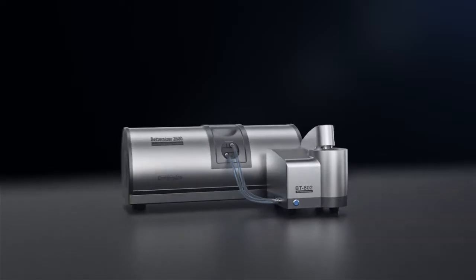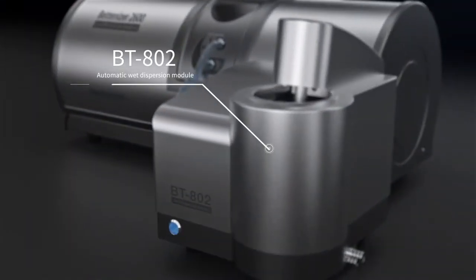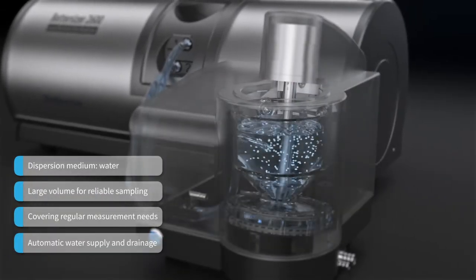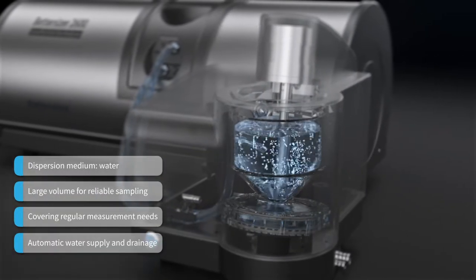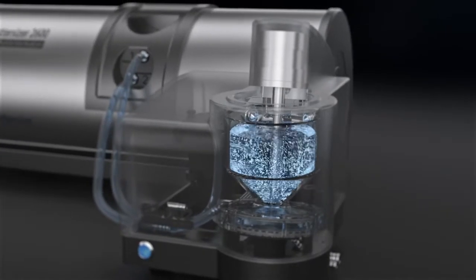Matching up with the BT-802 automatic wet dispersion module, the BetterSizer 2600 can efficiently measure the size distribution of particles dispersed in aqueous mediums. Adjustable stirring speed and built-in ultrasonic system ensure stable dispersion of samples.